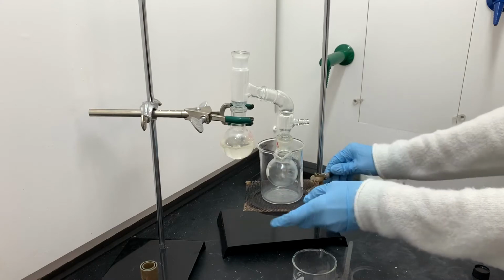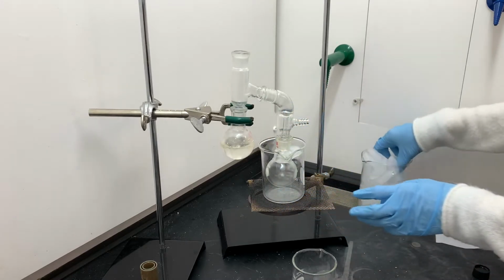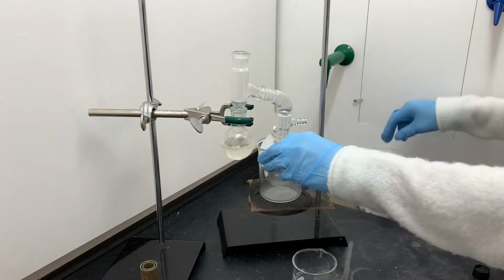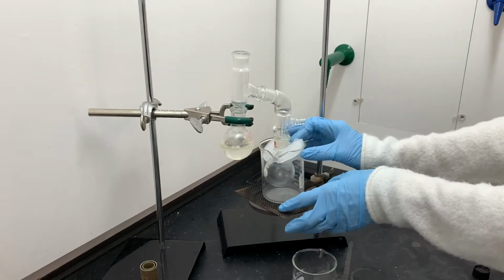So there's my receiving flask, and I've got it nestled inside a beaker. The beaker is going to get filled up with some ice cubes. Remember, we want to have this round bottom flask nice and cold to help create a pressure differential so that our fumes get sucked down into that receiving flask.